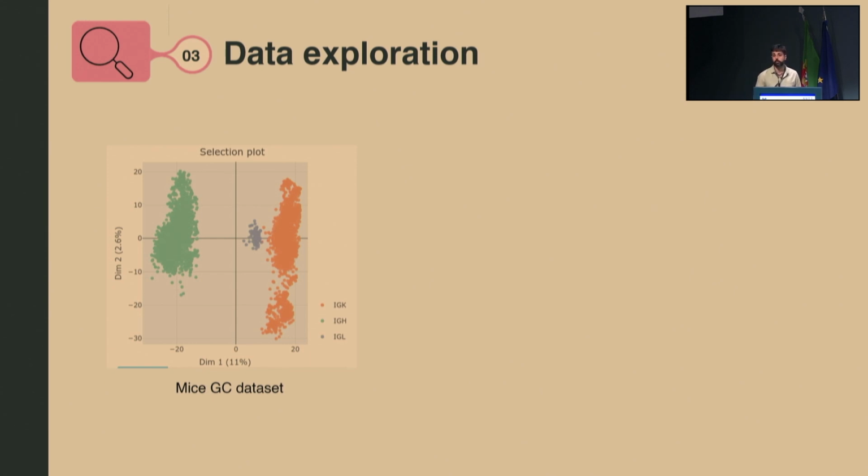So this works as intended. It's nothing new, but it's a measure of quality. And here you have these 10,000 features, including a PCA. So you can easily get an overview of your repertoire or repertoires. This can scale up as much as you want. You can add as many data sets as you want.